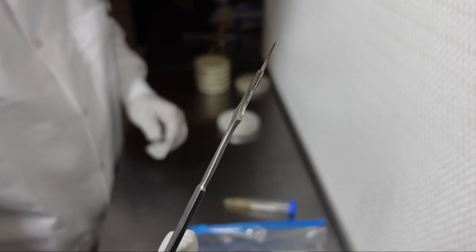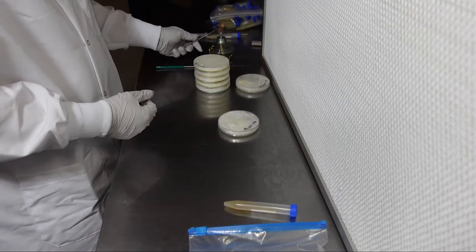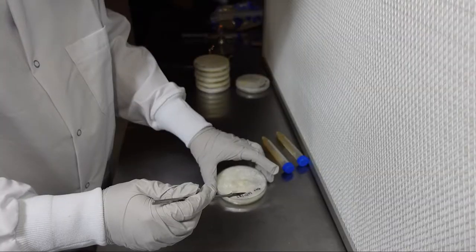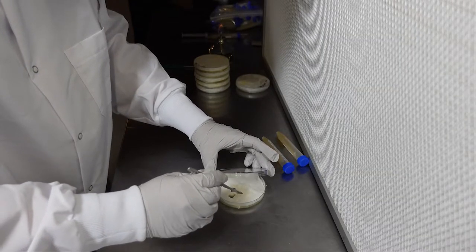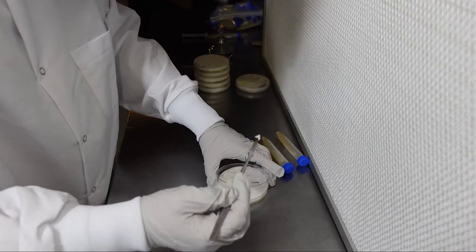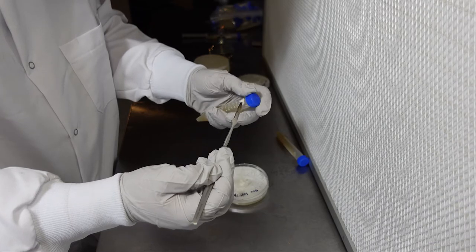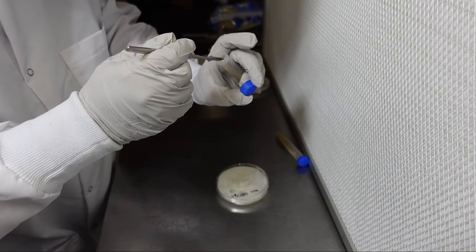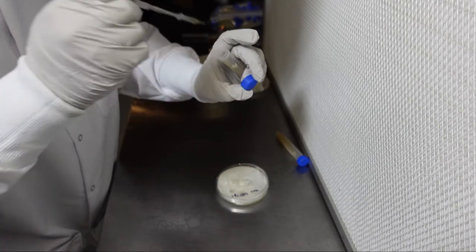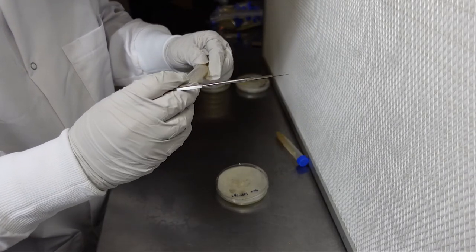Once your space is clean, start by flame sterilizing your scalpel until it's red hot. Let the scalpel cool for a few seconds and then cut a small wedge of agar and transfer it to the agar tube. Once you screw the lid back on and label your slant, it's ready for long term storage.